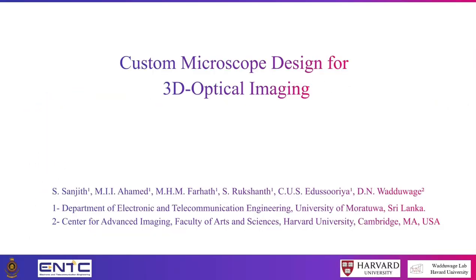Custom microscope design for 3D optical imaging. In modern science and medicine, 3D microscopic imaging is essential for exploring the complex architecture of biological tissues and nanoscale materials. However, achieving high-resolution 3D images presents challenges including limitations in optical techniques and data processing. Overcoming these hurdles is vital for advancing innovations in medicine and material science.